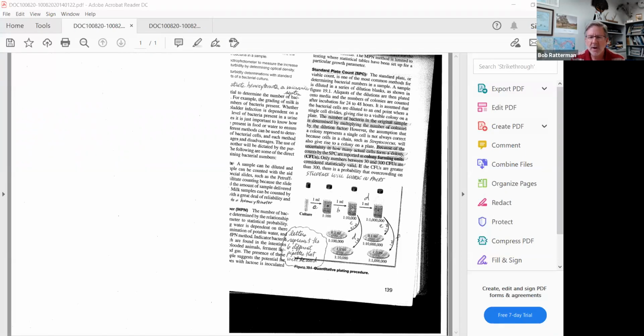So it came from the 1 in 10,000, and therefore that amount of E. coli suspension in that plate is a 1 in 10,000 dilution.